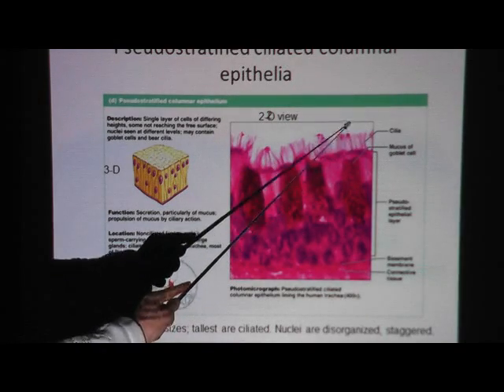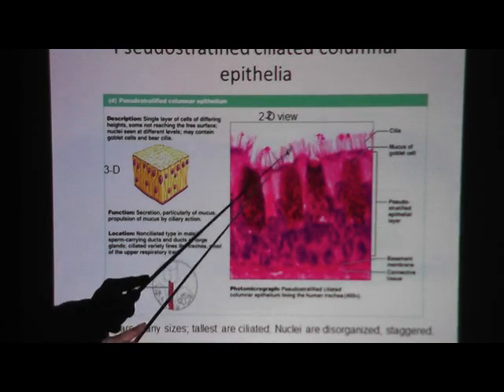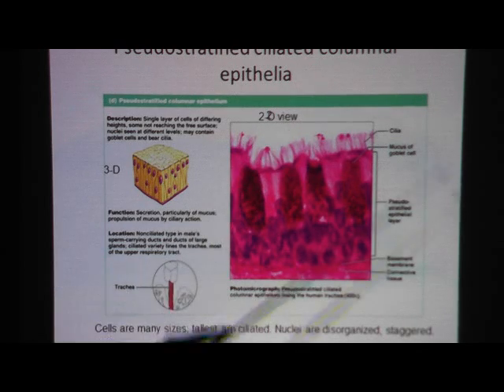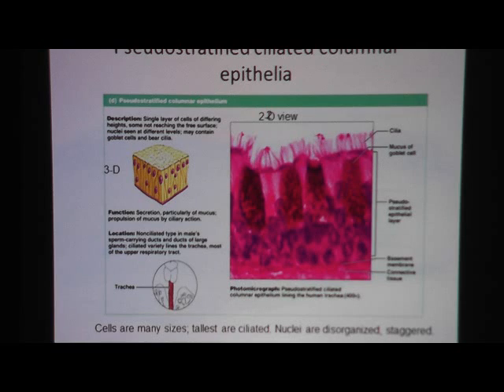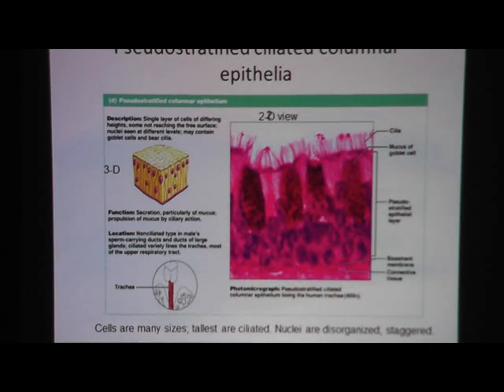Ciliated means it has cilia. With cilia, you can actually see the strands — those little lines coming up at the top. Cilia is longer than microvilli; microvilli is shorter and blurry, cilia is much longer. These cells are tall and skinny, so that's why it's columnar. And of course it's lining a surface, so it's epithelium.